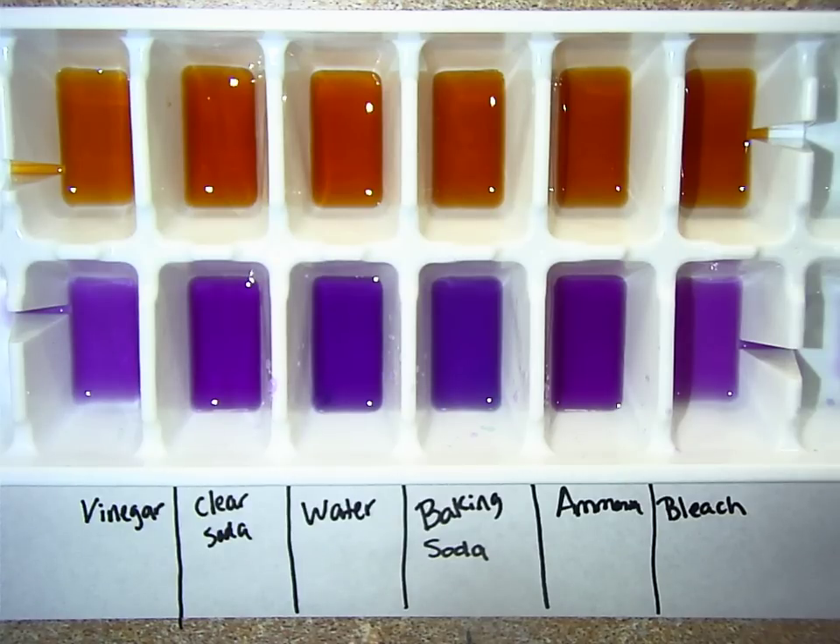Okay boys and girls, here's a short demonstration of our lab that we did today. Today I'm using two indicators: black tea and red cabbage juice. Although it's purple, we call it red cabbage juice.